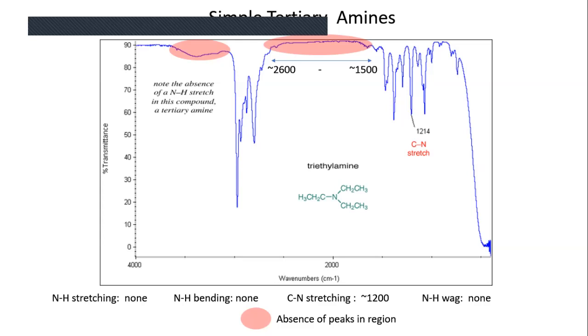If you think, hey, this unknown spectrum doesn't match with anything, then it's not going to be anything with an NH or N in it, or NH2. So you have to look, okay, which one of my compounds doesn't have any type of nitrogen in it? And that would be that compound. So that's how you're supposed to do those questions.